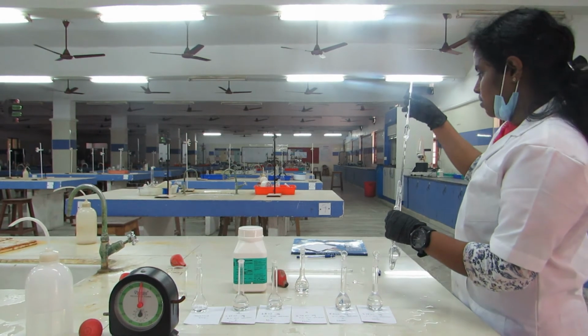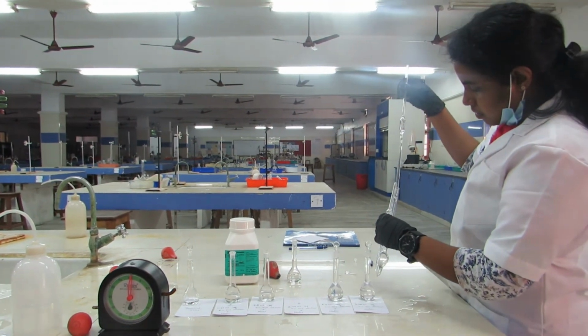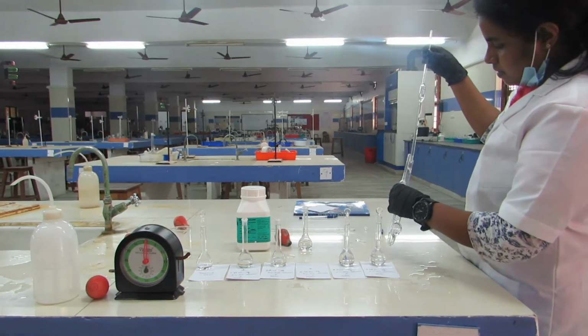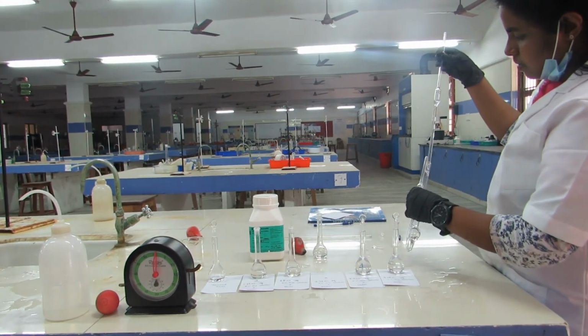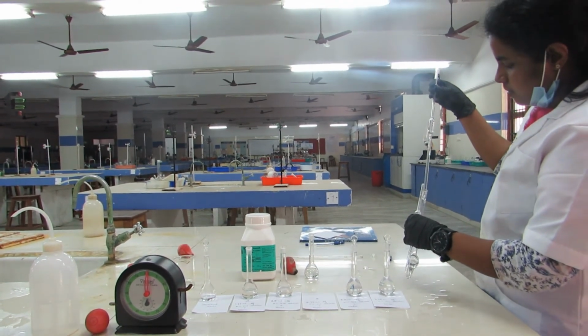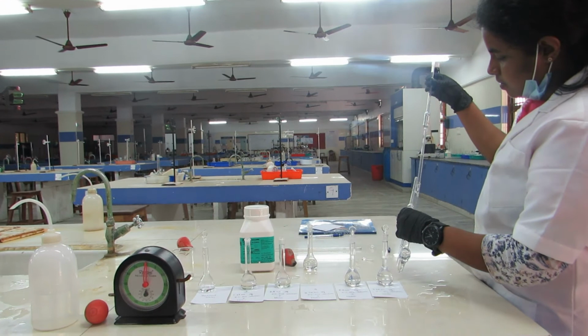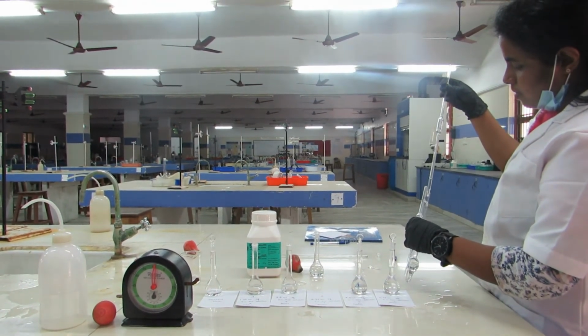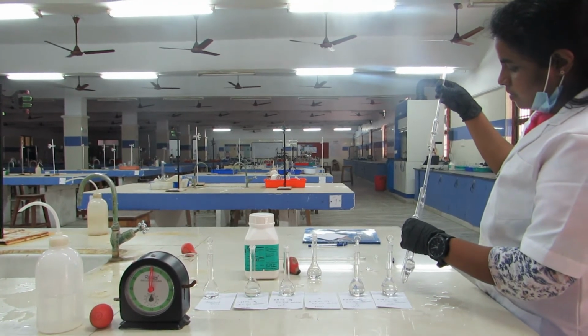It is better to keep it at 45 degrees. We can avoid the formation of bubbles inside the viscometer. During the measurement, there should not be any bubbles inside the viscometer. That is the important thing.